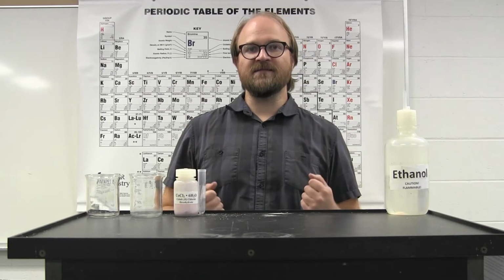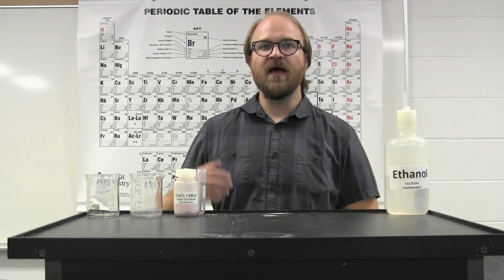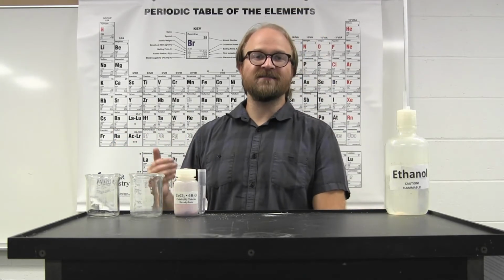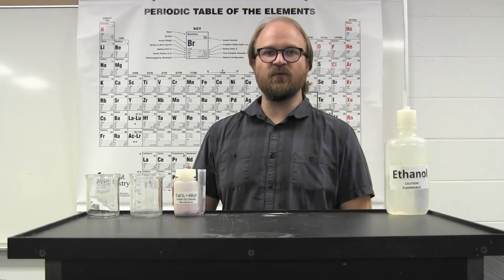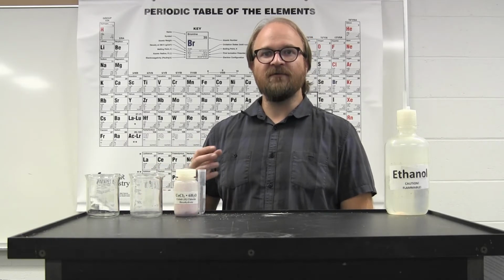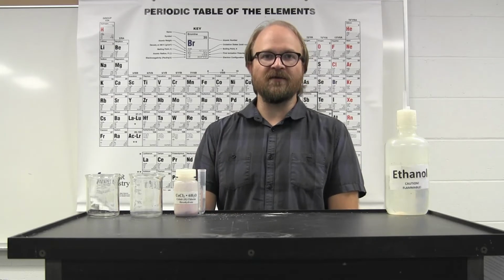and the cobalt hexaaquo complex. The balance between the cobalt ion bound to 4 chloride ions to form the cobalt tetrachloride complex, or bound to 6 water molecules to form the cobalt hexaaquo complex. It's the balance between these two that allows you to see the differences between them. And later on, you can see that it's temperature dependent, and you can figure out with the concept of heat and thermodynamics whether energy and heat is either a product or a reactant.